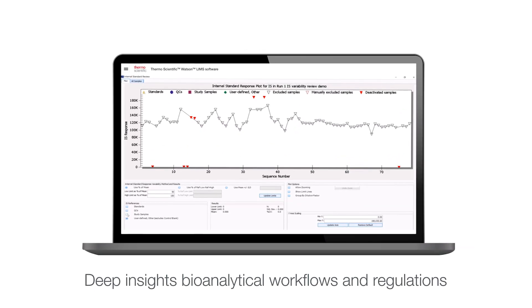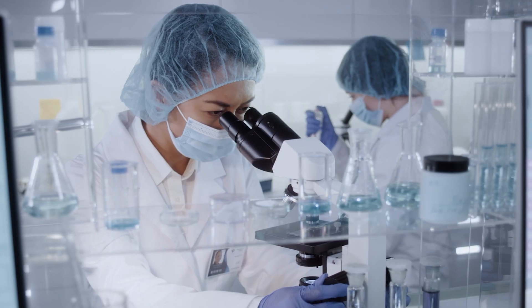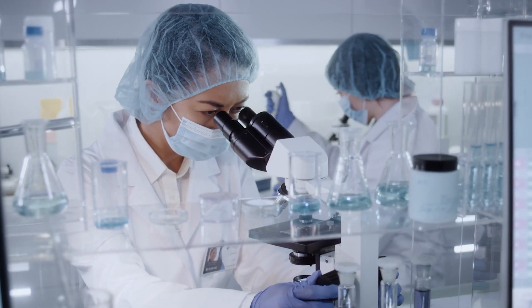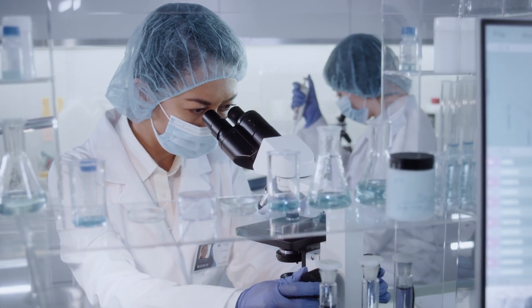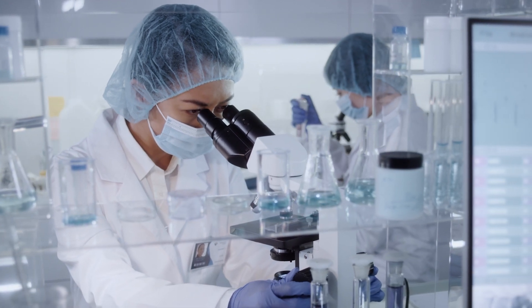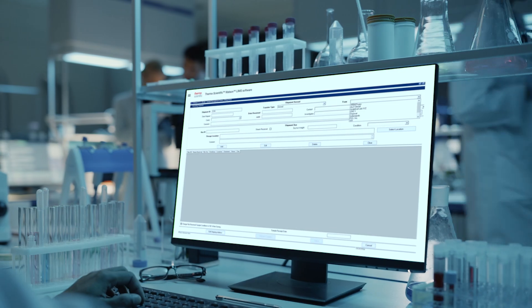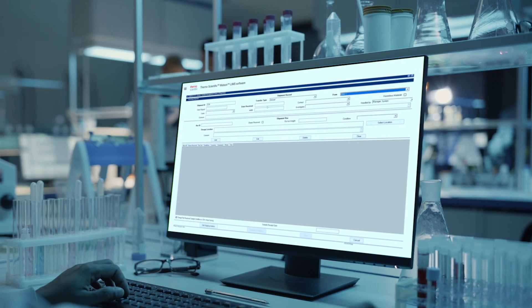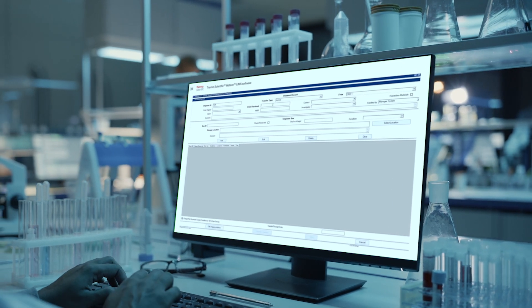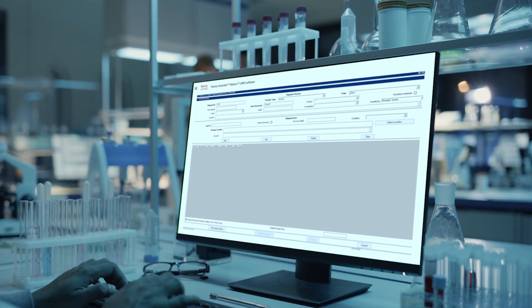Watson-LIMS excels at data management, supporting non-clinical and clinical workflows from start to finish. It enables rapid setup of studies or the import of external designs, helping to ensure controlled execution and precise parameter capture.